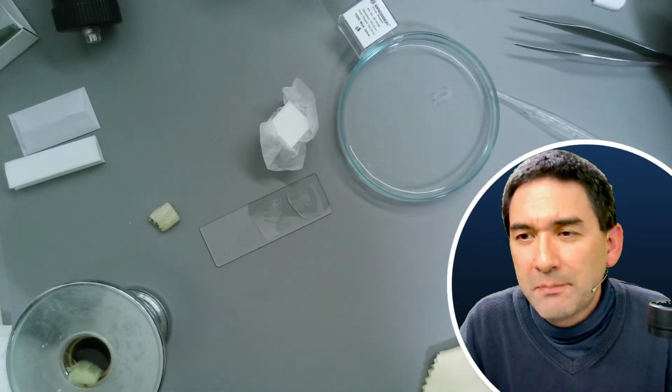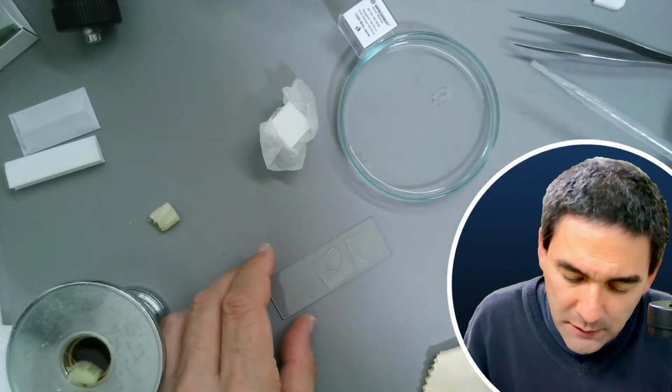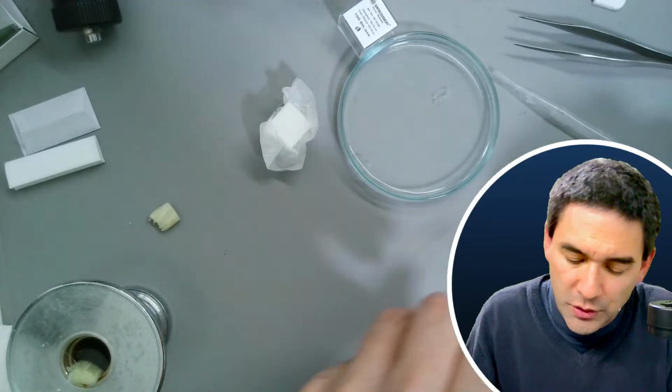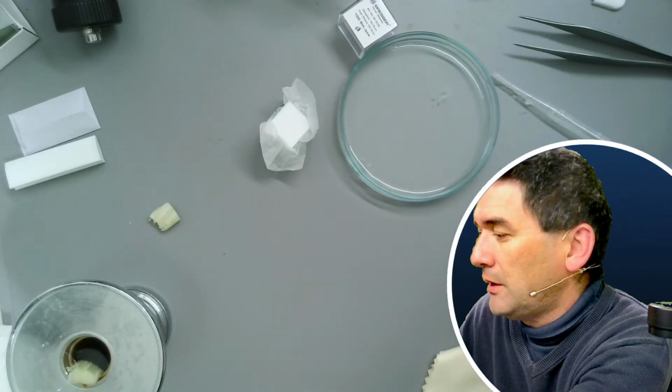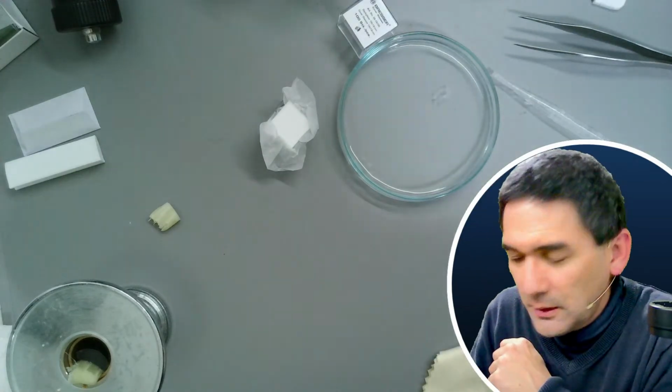Aren't those pipettes disposable? Yes, they are. But if I'm just using regular water, I'm just recycling them because there is no reason for me to throw them away. Let's just quickly see.